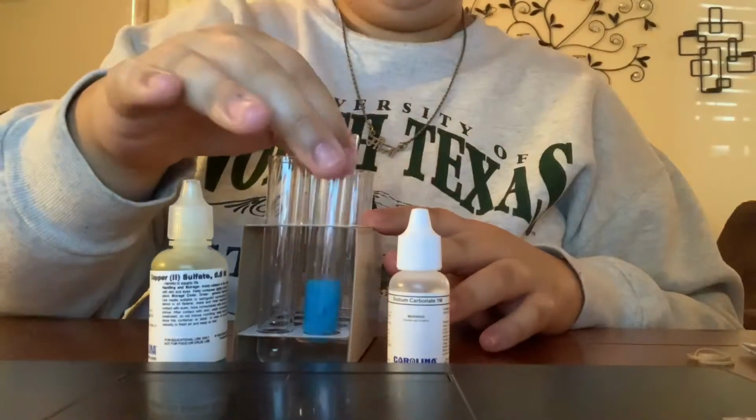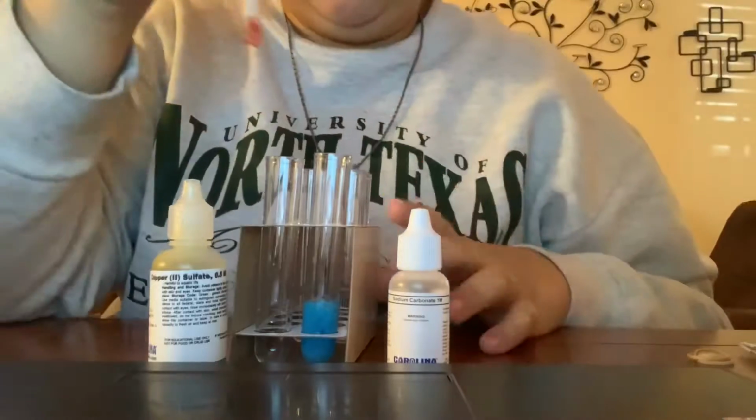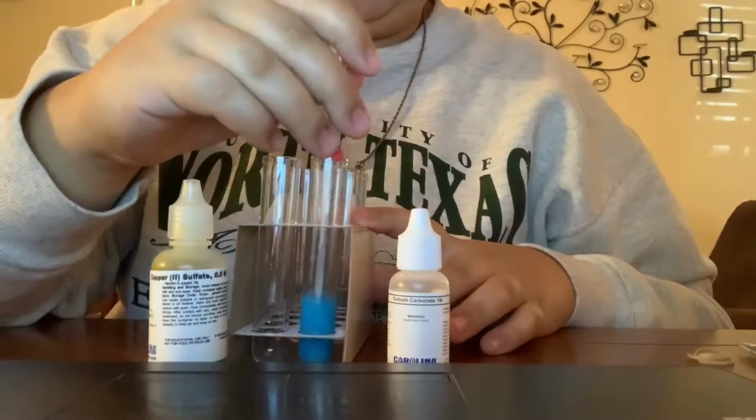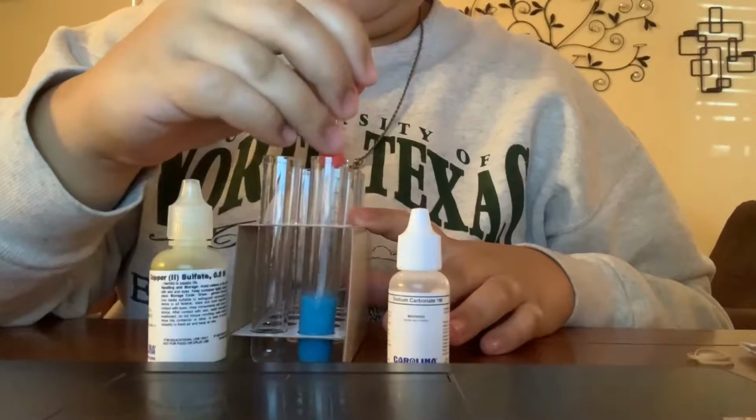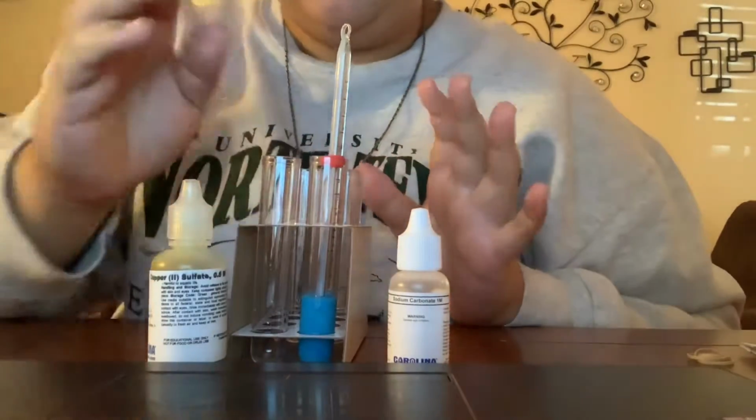Nice and thick. All right. So I'll now take the temperature. Not my temperature, the temperature of the two materials. I'll throw a little bit, and we'll just wait and see. And then I record the following data in the table.